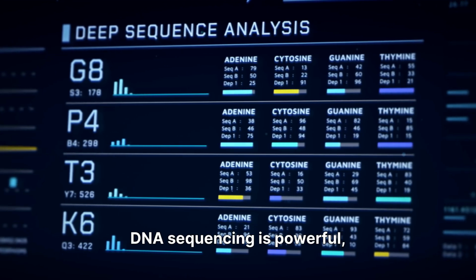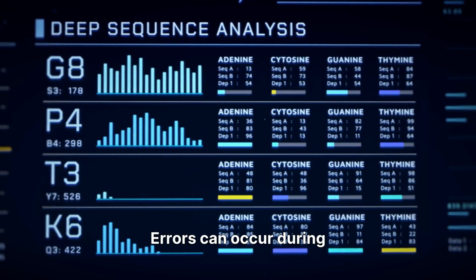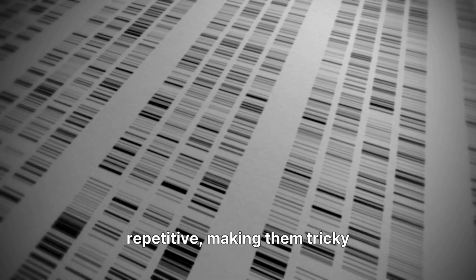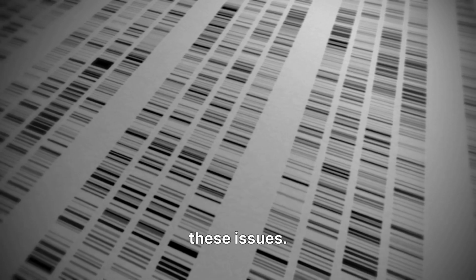DNA sequencing is powerful, but challenges exist. Large amounts of data must be stored and analyzed. Errors can occur during reading or assembly. Some genomes are very repetitive, making them tricky to piece together. Advanced algorithms and high-quality lab techniques help overcome these issues.